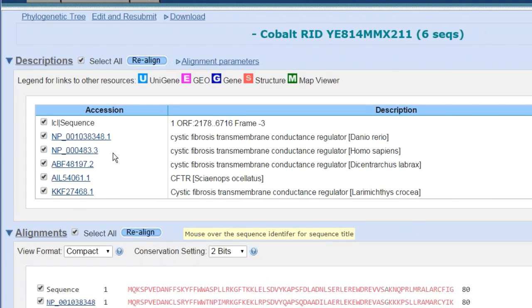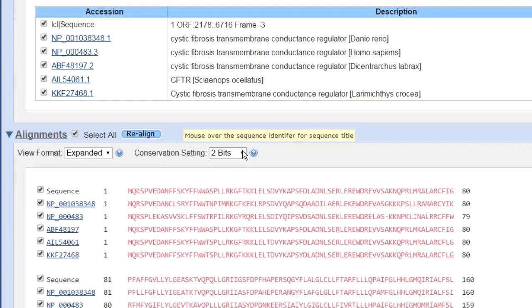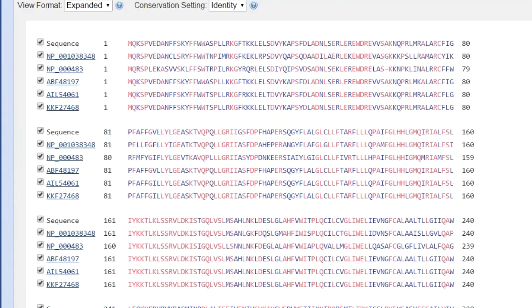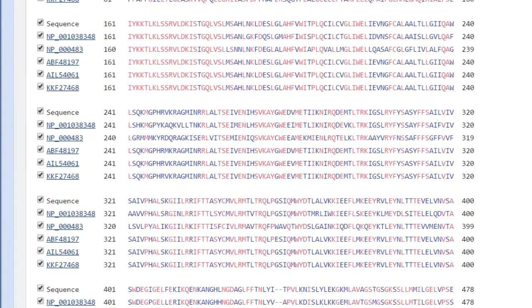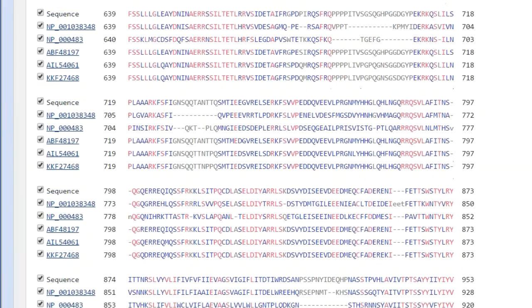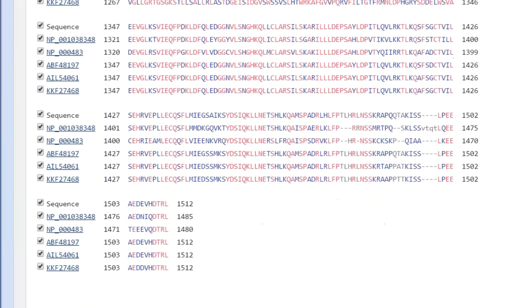Here are the five sequences including my query at the top. This is the Cobalt display, which many of you may be familiar with. I can change the way it looks — I like the expanded view and I like to change this to identity. This gives me a sense of what the differences are among these different proteins. This is a full-blown sequence alignment giving you the full-length appreciation of how these proteins are related to each other, which is different than what BLASTP gives you.